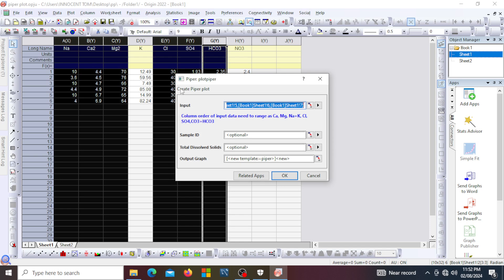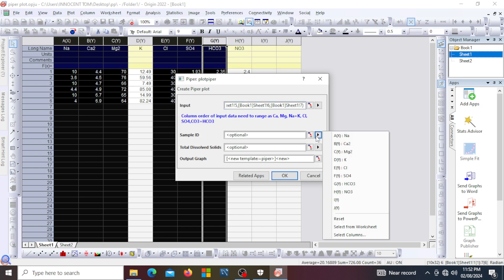These are optional tags depending on what you are checking for. If you had the total dissolved solids, you could select this and pick the total dissolved solid. Whatever you want to name your sample, you could also come here to pick an option.